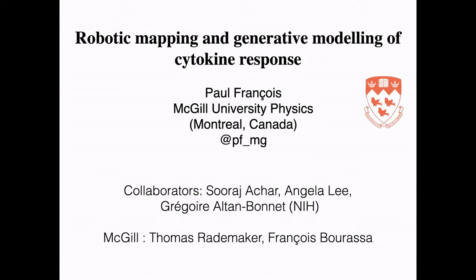I will tell you it's really a new approach. Nothing is published yet, so I'm really looking forward to hearing from you, and I would be very happy to have your feedback on this new approach on robotic mapping and generative modeling of cytokine response. So before I go there, I would like to tell you a bit where I'm coming from and what drove me toward this project.